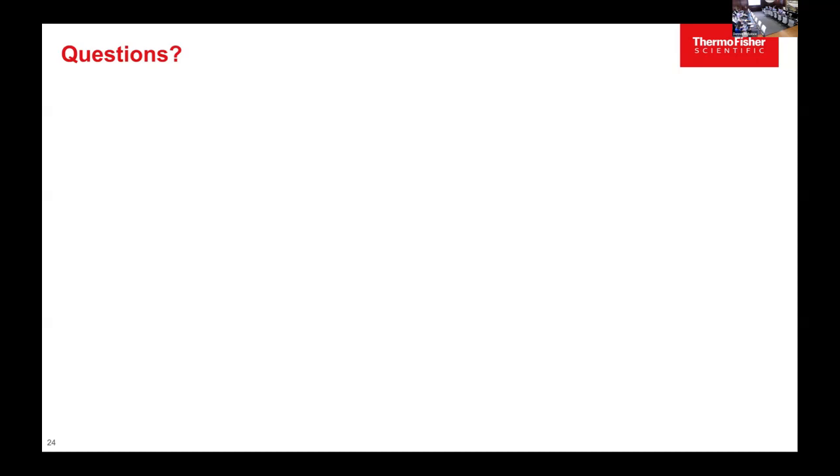The differences are super concerning to me. As someone who's old school MS/MS DDA, where have you guys evaluated where Chimerys fits into that niche in terms of overlap with Spectronaut and DIA-NN?